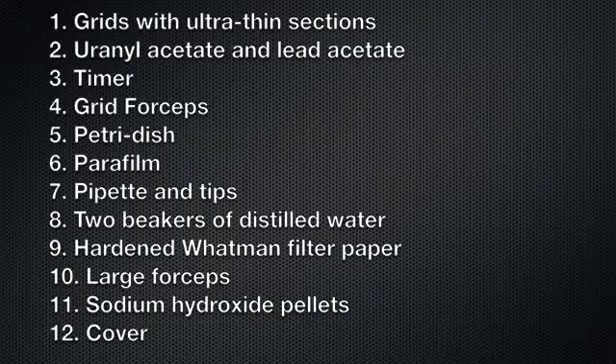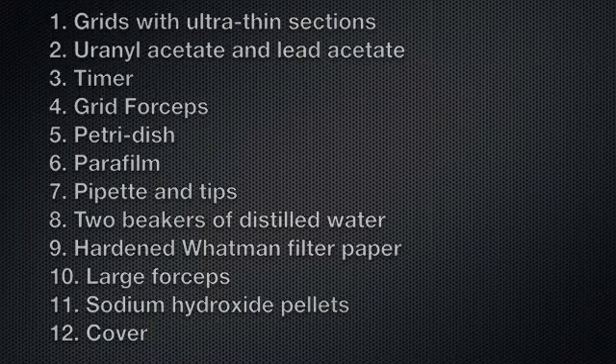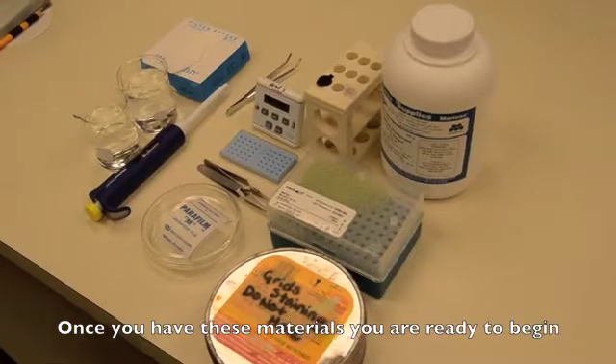Here's the list again for reference. Once you've assembled all these items, you are ready to begin.